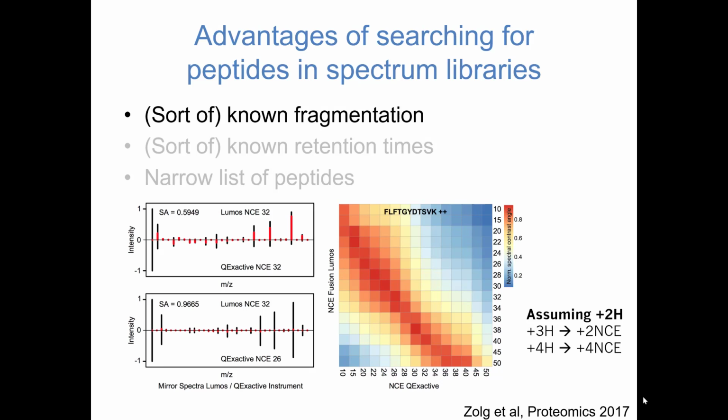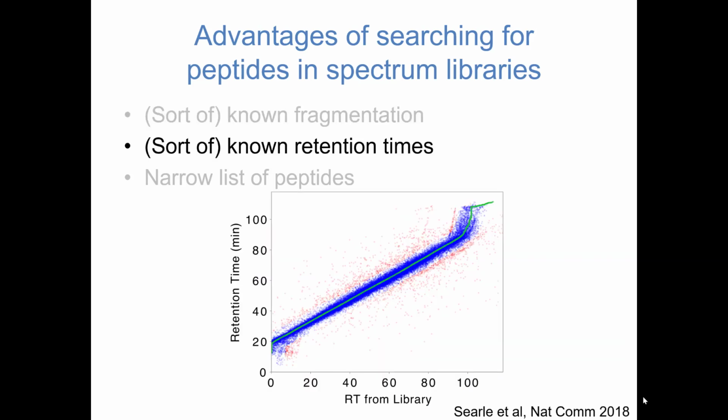But they were basically trying to acquire even the +2s, +3s, +4s, all as if they were +2 in terms of the collision energy. That's definitely one way to go. At least, even though it's not optimized for that spectrum, at least it will match what you expect to see, so that's a definite advantage. But that can be a pretty significant issue with analyzing these libraries.